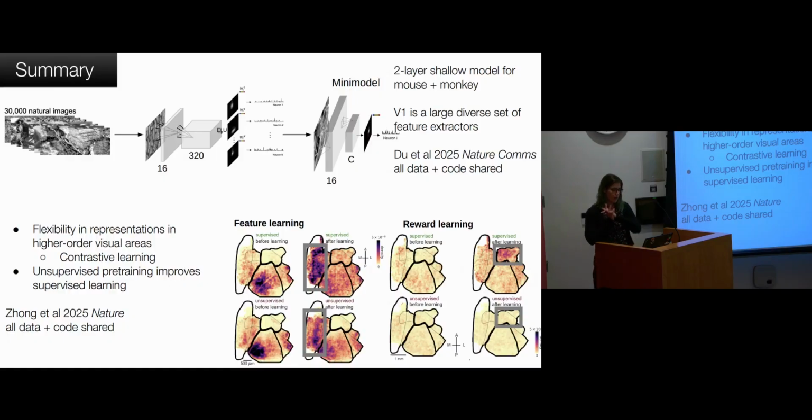What you can do if you're having issues is tune a little bit the high pass filtering in space. So that's how much we high pass filter to get rid of the neuropil, the background signals. If it's too small, you'll miss cells if the cells are big, or if it's too big, maybe you're not subtracting enough of the neuropil and it can be harder to find. For low SNR, also, I would recommend trying something like Cellpose2, which is just anatomical. But yeah, that's the very, very broad summary.